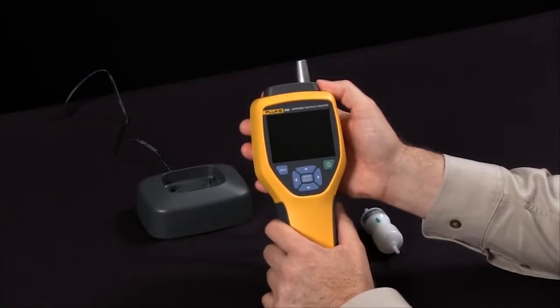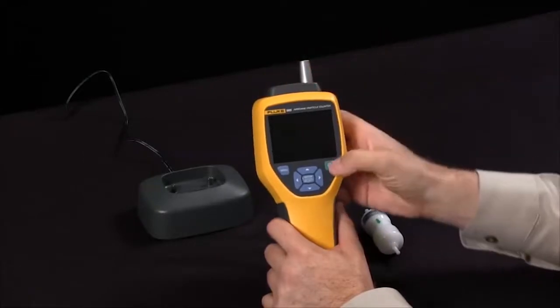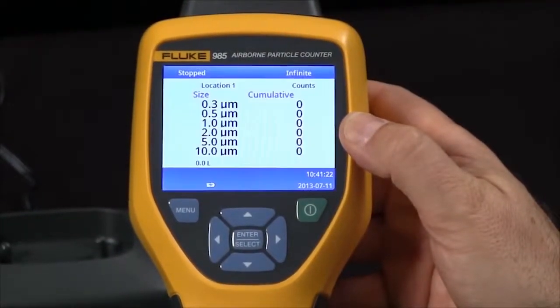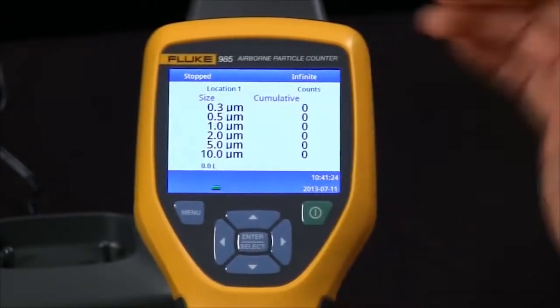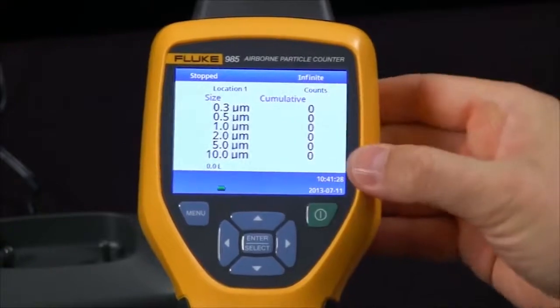How do I take measurements with the Fluke 985 airborne particle counter? Simply power on the device and your home screen will show you that we are sampling particulates in six different sizes, everything from 0.3 micron up to 10 micron.